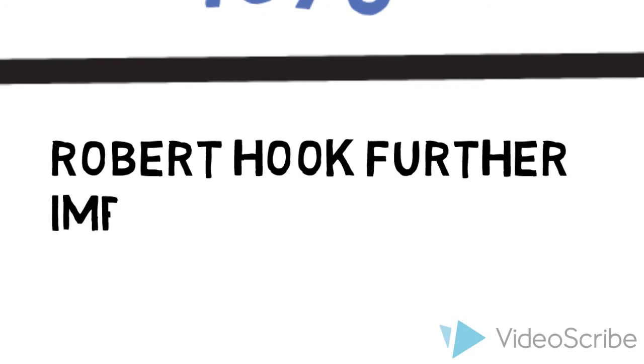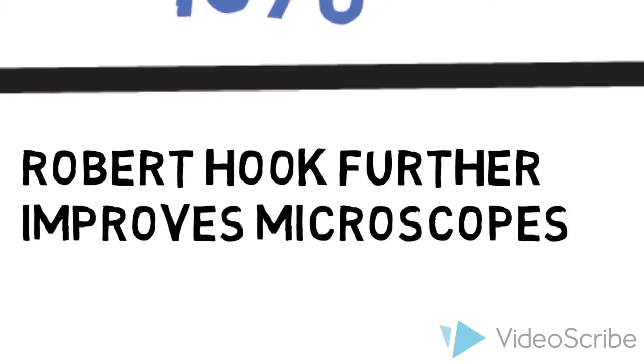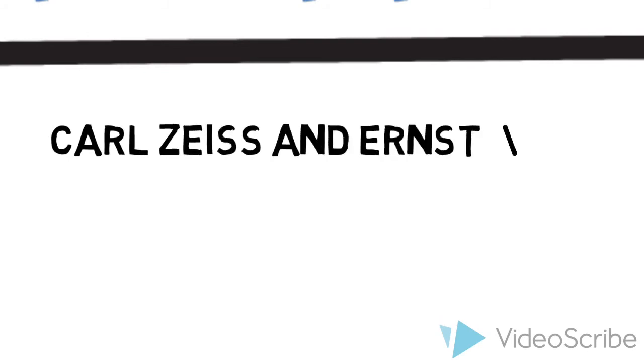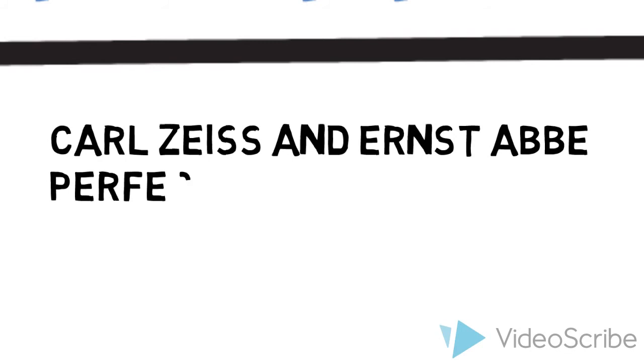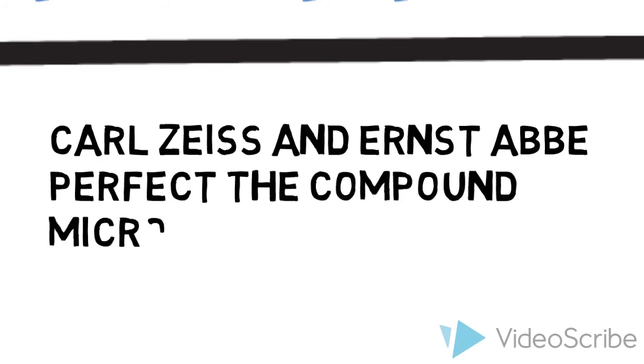In 1670, Robert Hooke further improved the compound microscope. He was also the first to discover the structure of plants, chambers of which he called cells. From then on, not much happened until the 1800s, where Carl Zeiss and Ernst Abbe perfected the compound microscope. Their designs became the standard for microscopes of their time and the blueprint of all modern microscopes.